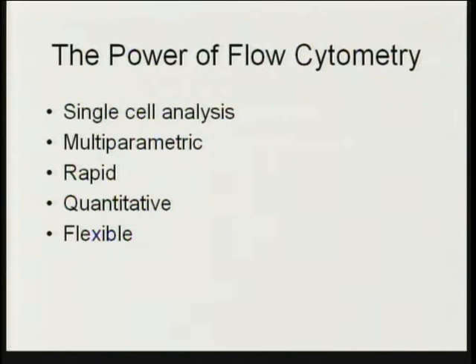So what is flow cytometry? Well, flow cytometry is a very powerful technique for the analysis of single cells. It's one of the few techniques that really allows one to look at single cells and gain a lot of information about each of the individual cells.